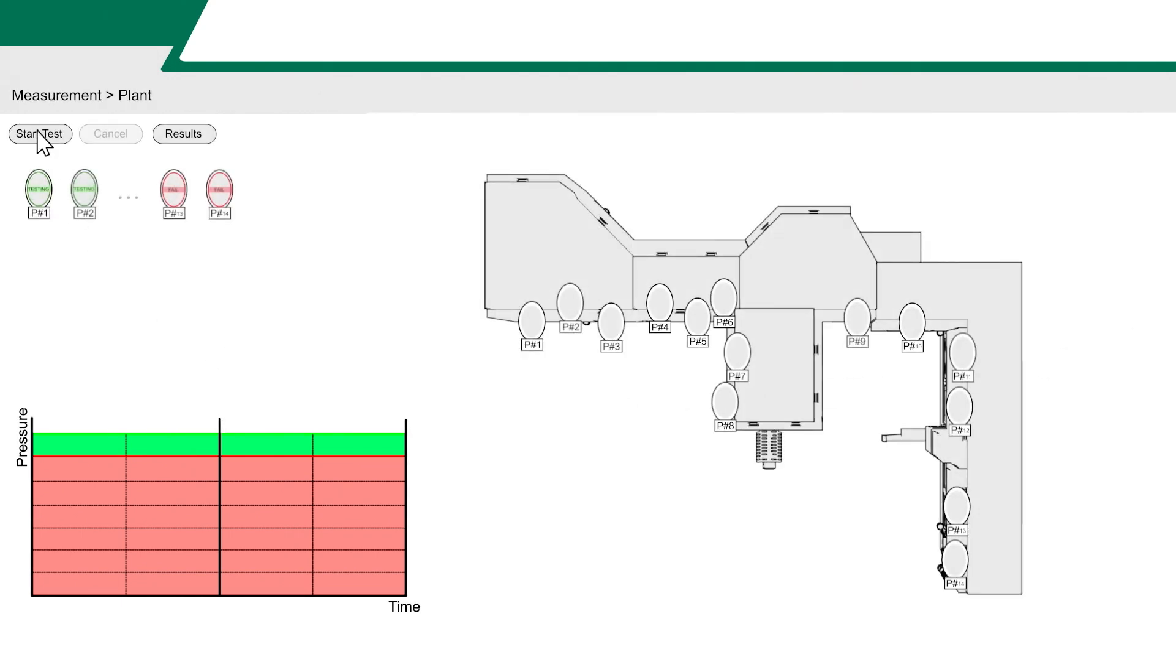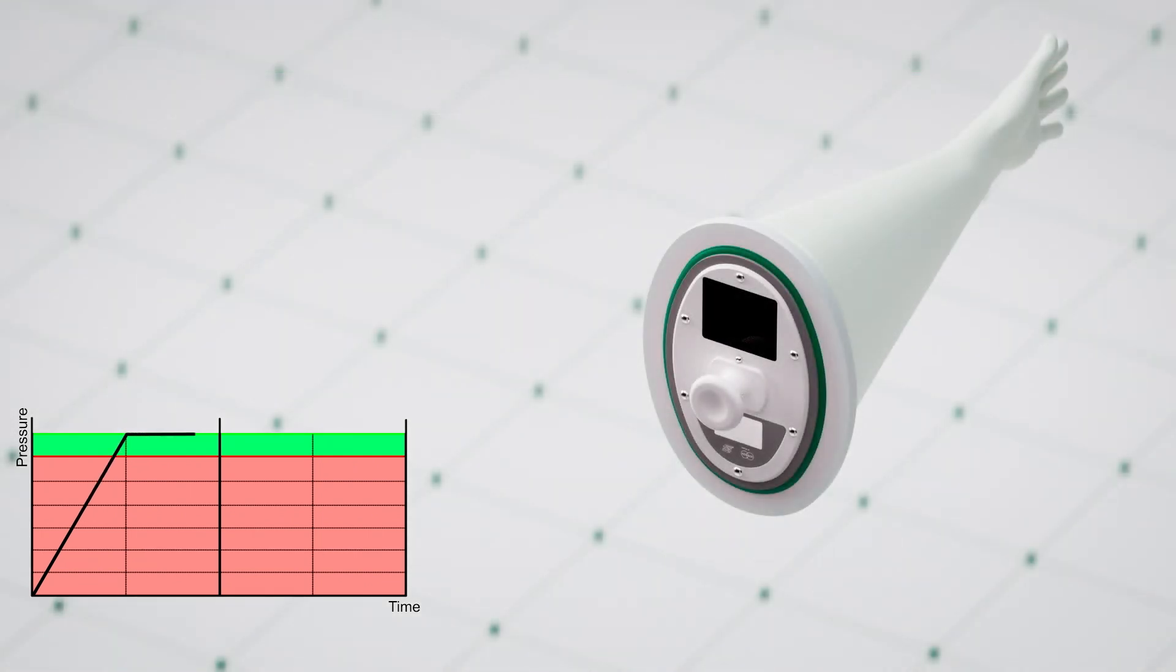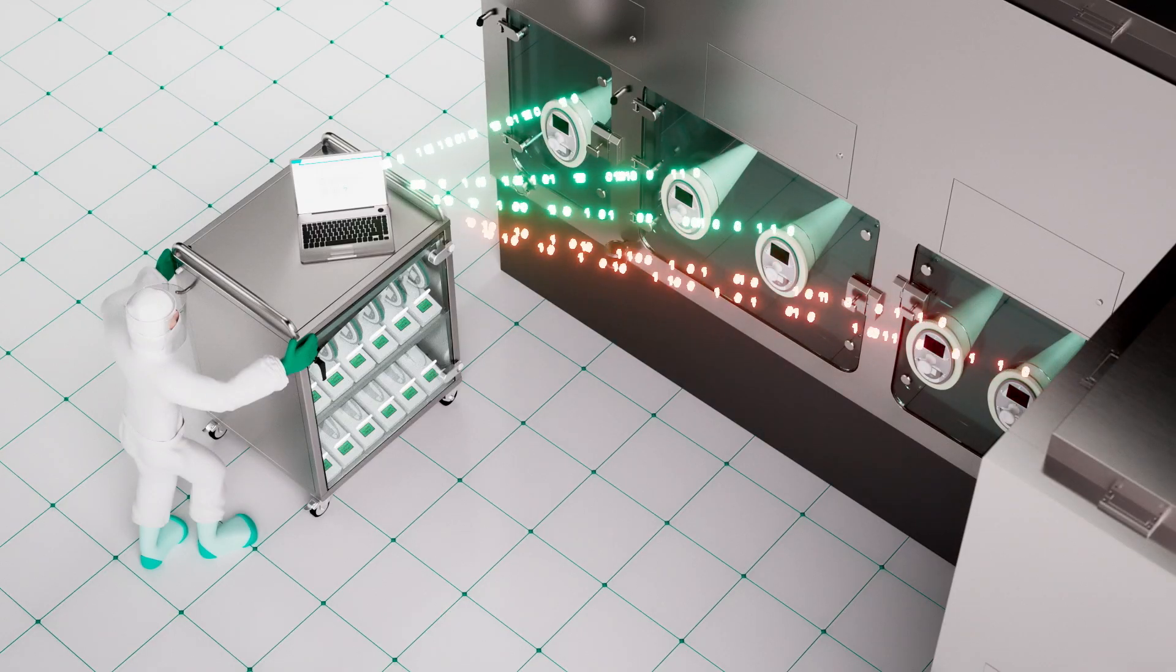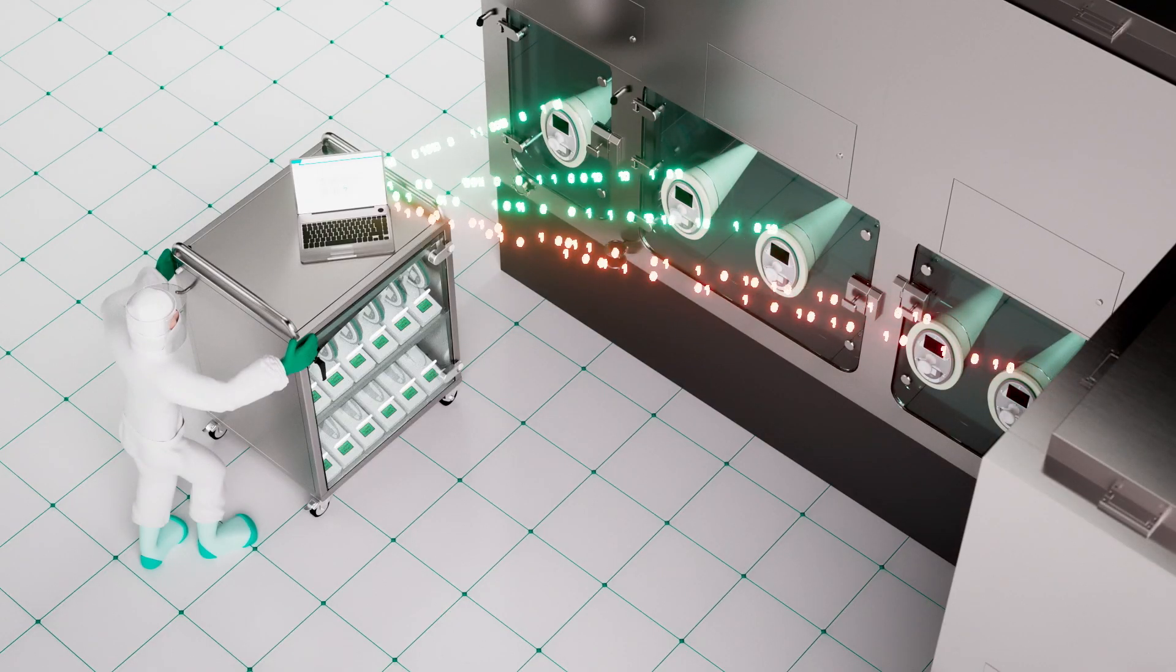You can easily monitor the test within the software. If one glove testing disk detects a decrease in pressure, you'll get an instant feedback.